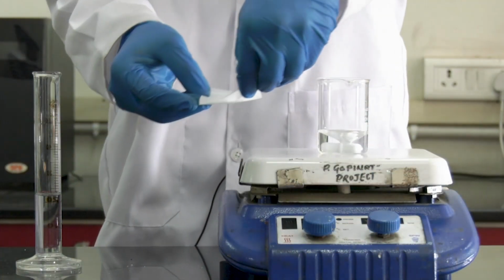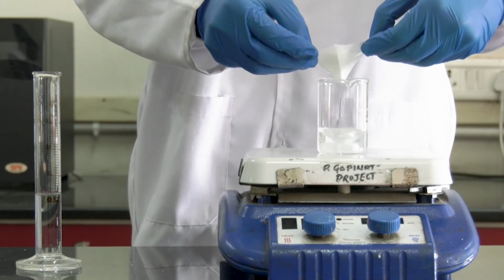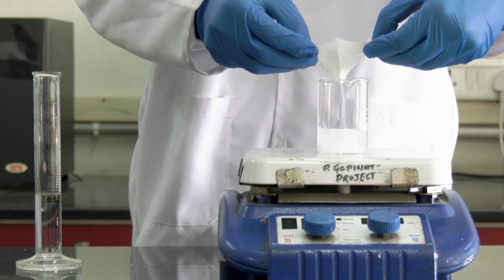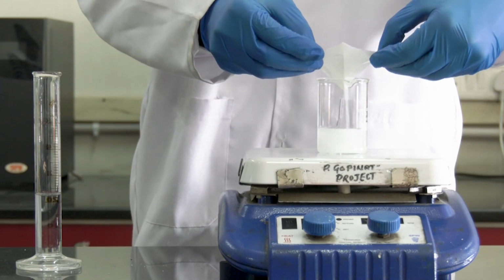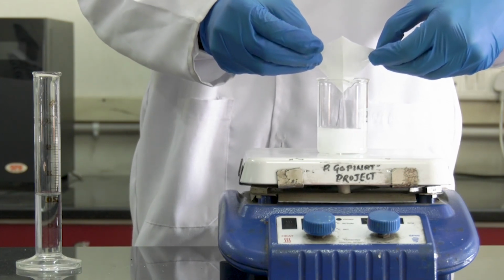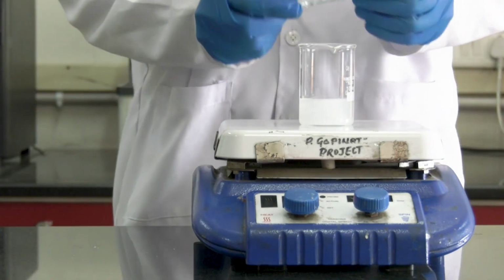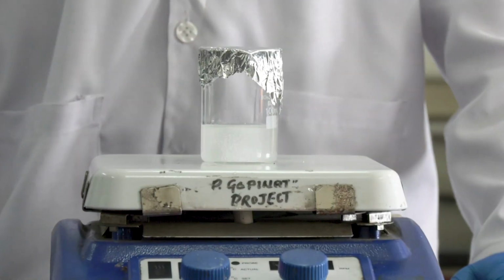Gradually add the PVA powder into the beaker. Cover it with aluminum foil and continue stirring.